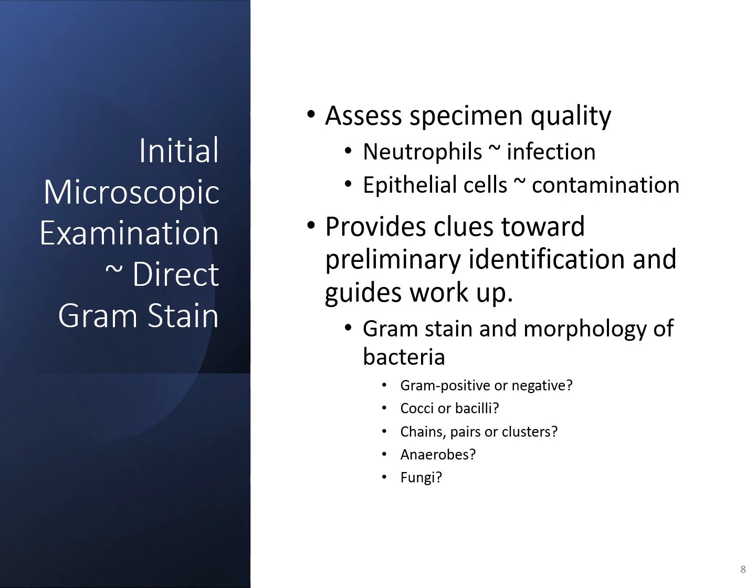Another way you could go with that is, if you would typically set up certain media for that particular culture, but you see an organism that wouldn't typically be found there, and maybe the media you would typically use isn't going to support it, you might throw in an extra plate to try to catch that particular organism that you're seeing.